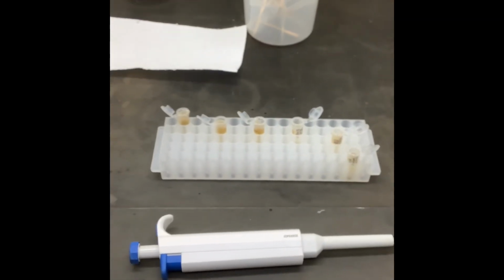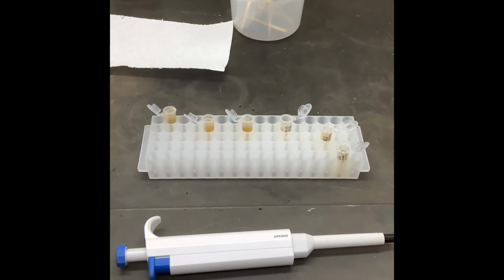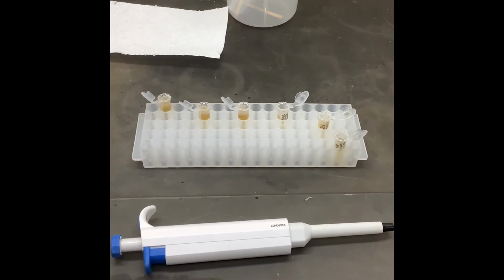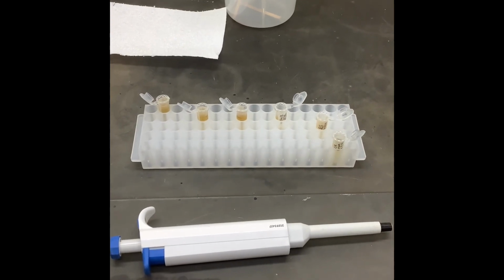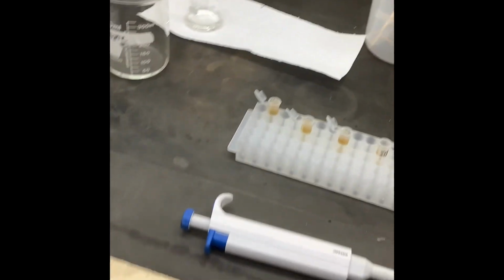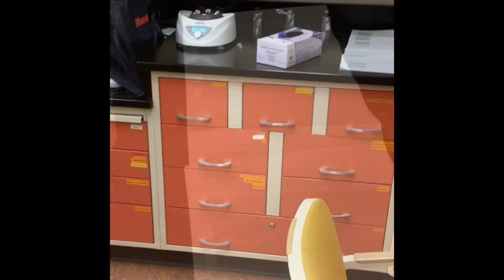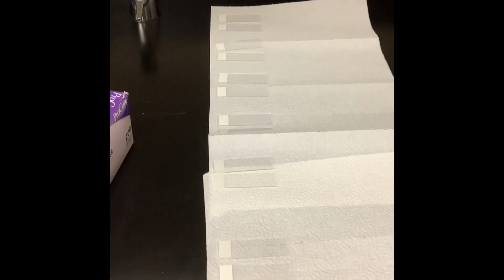So I've now removed the samples from the water bath. At this point, there should be no cotton left in the sample, and I'm going to let them sit with their caps open for about a minute, and then they're going to go back into the centrifuge for 3 minutes at 1060 G. While the samples are in the centrifuge, I went ahead and laid out all of those clean microscope slides that we made. I do 2 slides per sample, so I've laid out a total of 12 slides.